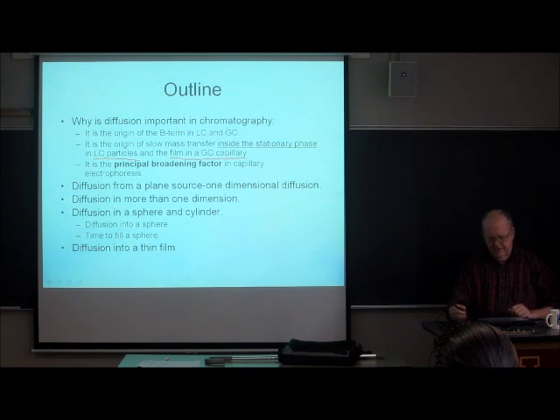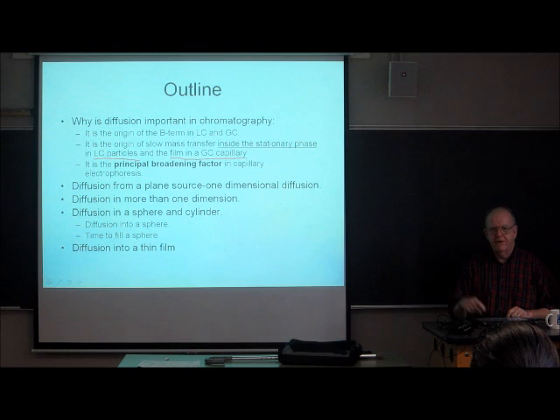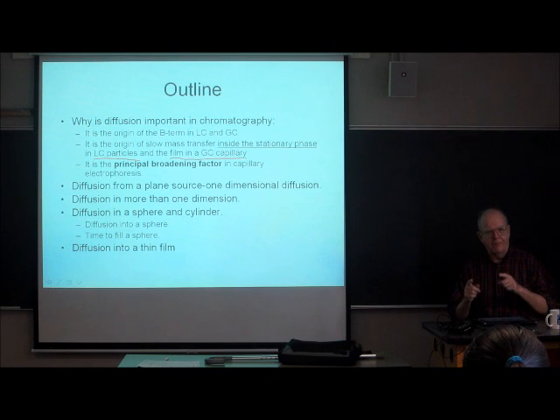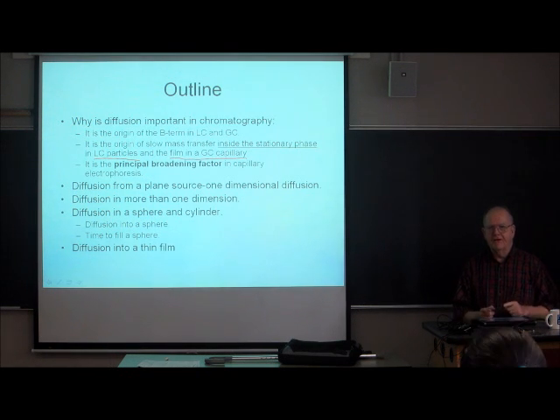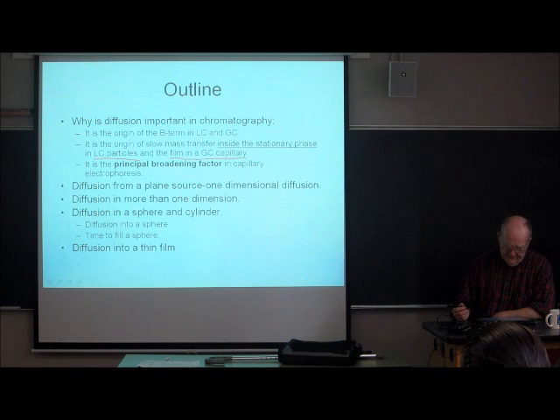In capillary electrophoresis, diffusion, longitudinal diffusion, is the principal broadening factor. If you're doing capillary electrophoresis properly, it's the only thing that's happening that broadens the peak. So clearly, you need to understand diffusion to understand capillary electrophoresis.